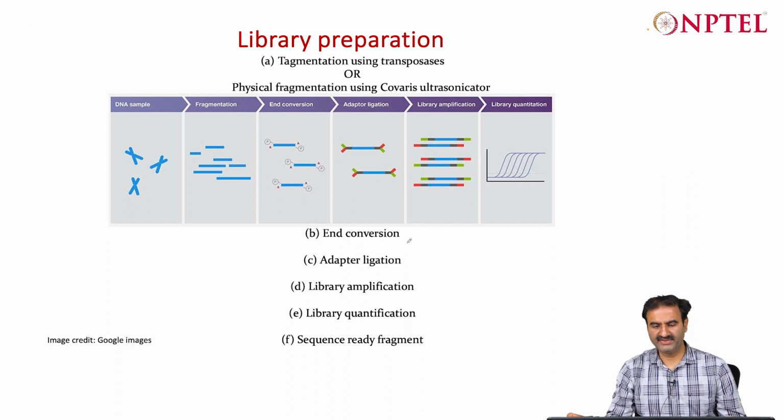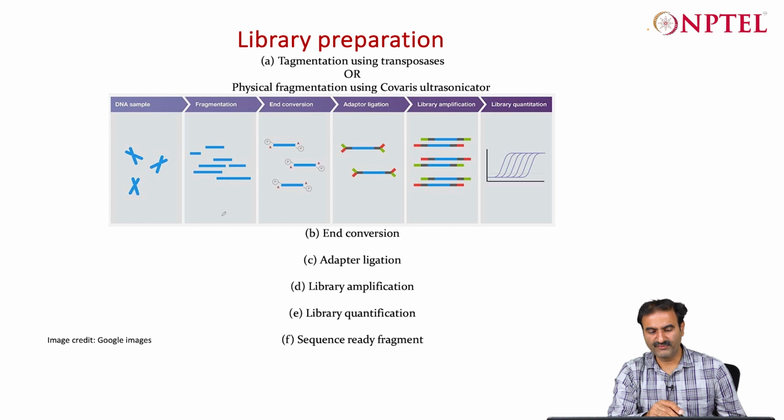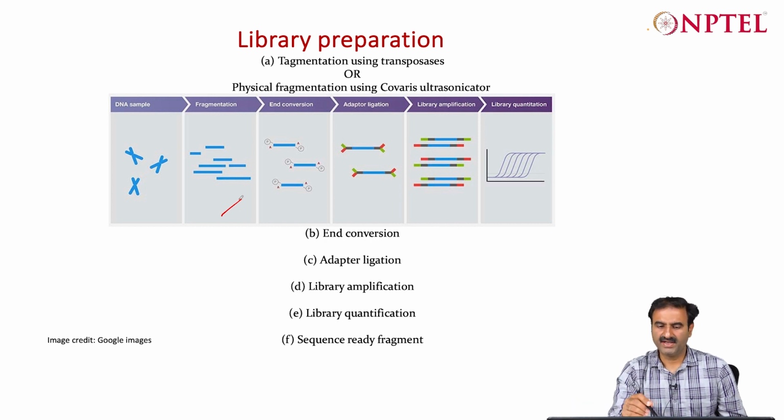Okay, so this is again the summary of that DNA, because here you have to do fragmentation because you are interested in shorter reads, with appropriate fragmentation of that particular size range, and the insert size is very important here. And in case of nanopore, you want high molecular weight DNA because you want to go for as long a sequencing product as possible, right? And then basically the adapter ligation and library preparation and the sequencing.